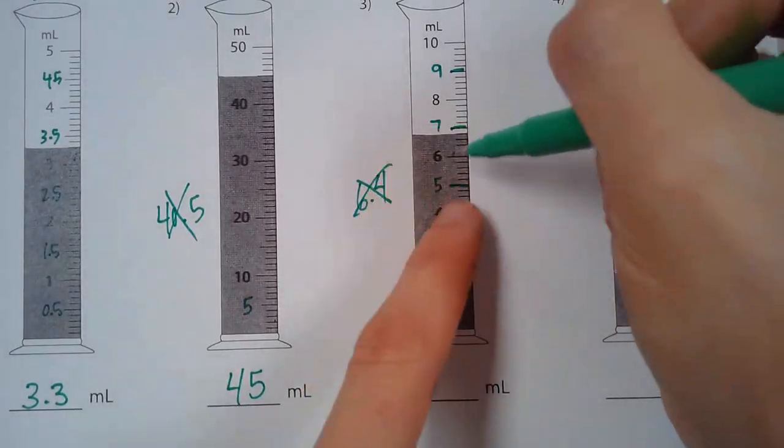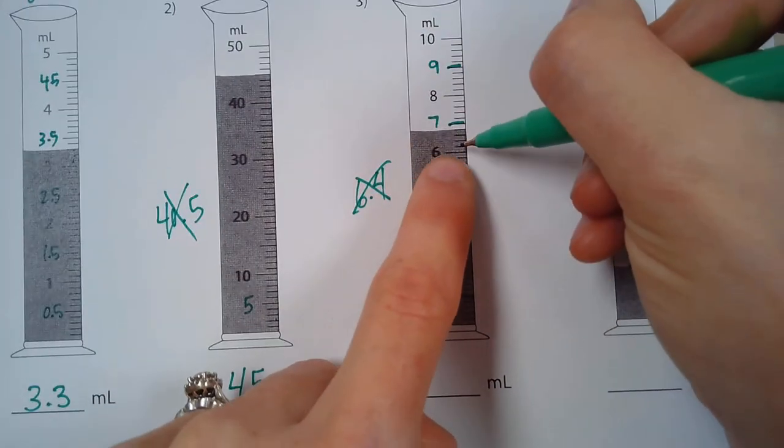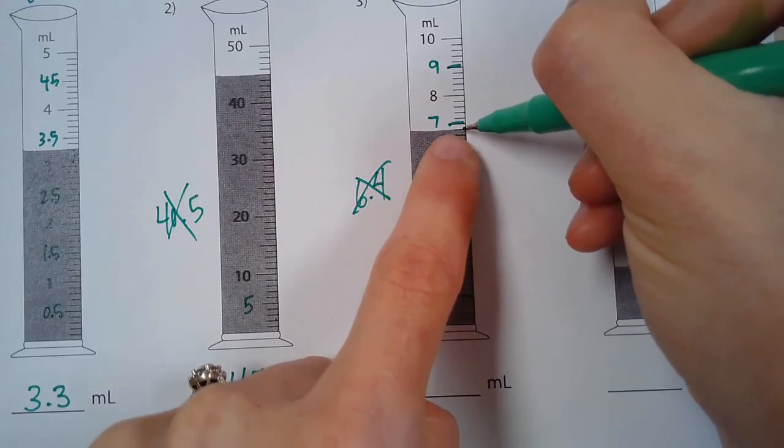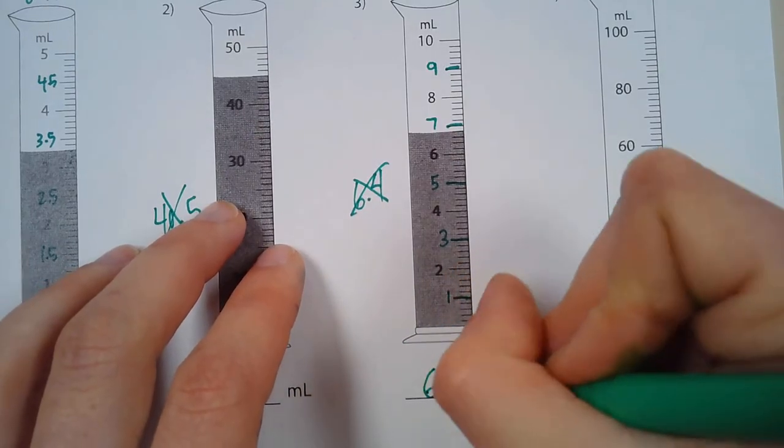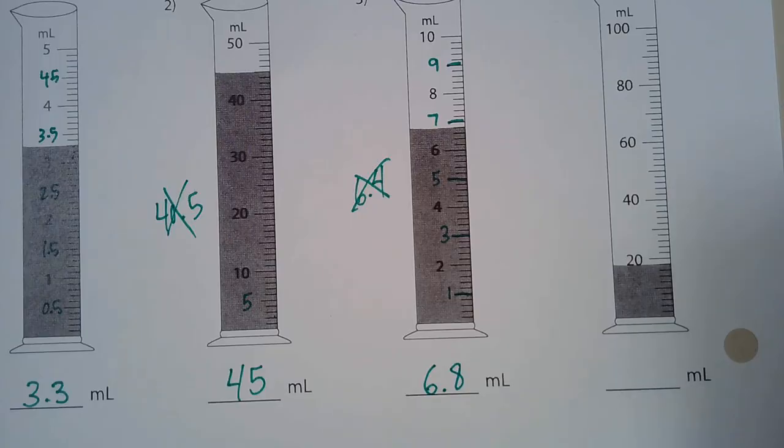So go back to where our liquid is, this shaded part, 6, 6.2, 6.4, 6.6, 6.8. And that makes sense.